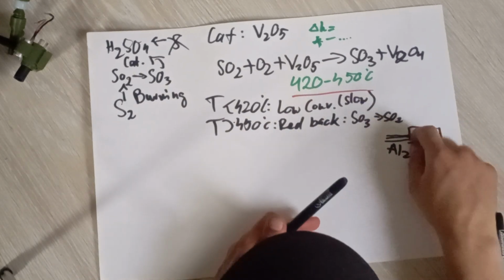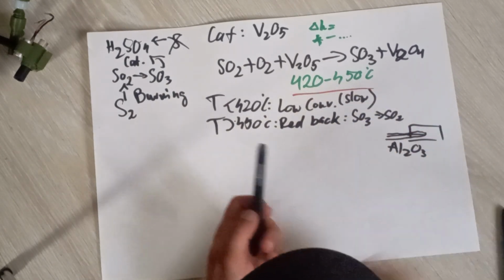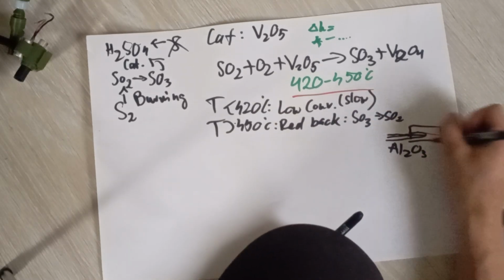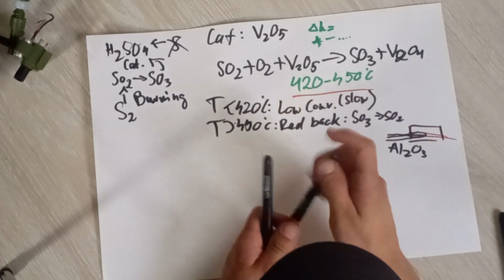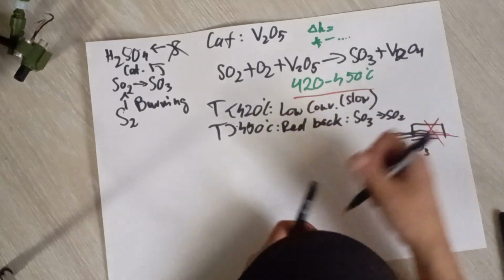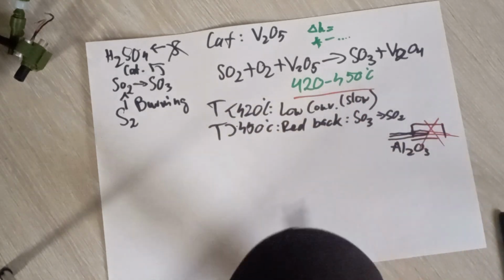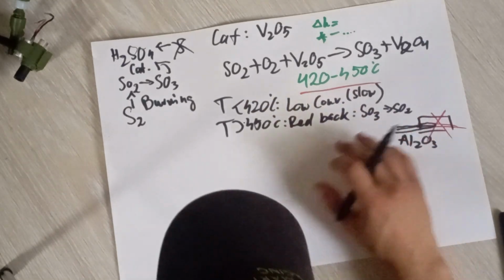Basically this is too thick for my little catalyst tube to go inside. My tubing is this big, so it doesn't fit. So it's a big X. For this reason, I can't do this, and I had to figure out something different.